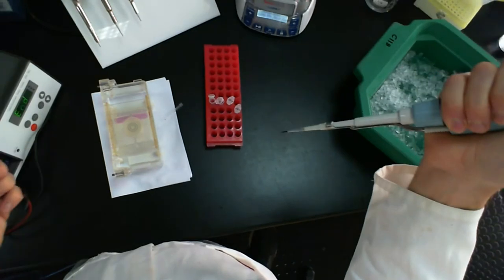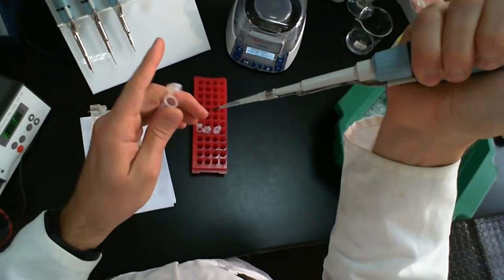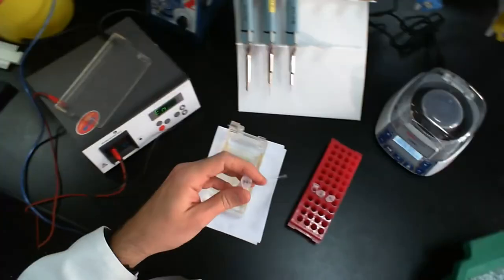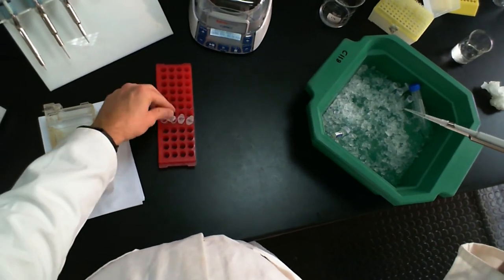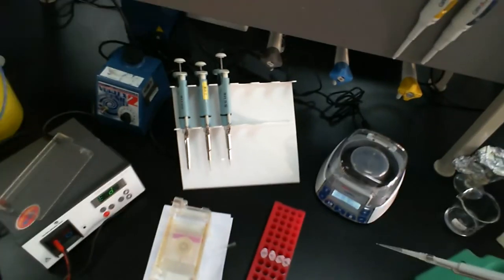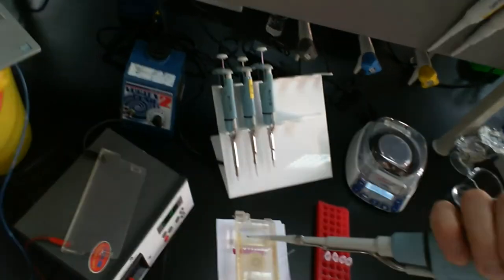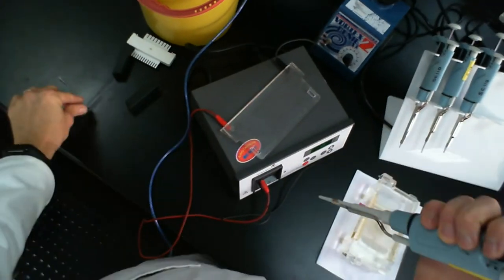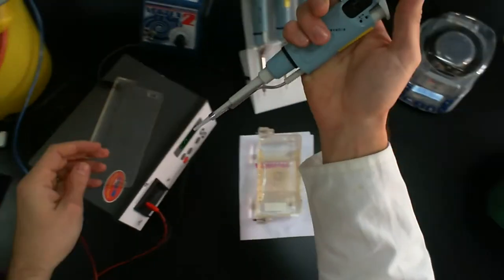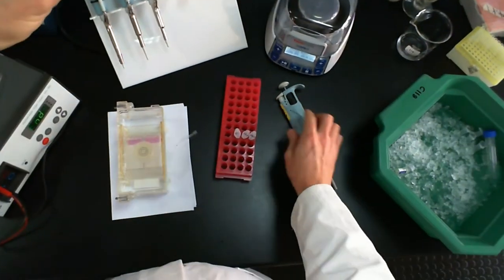Little bits. Okay, we need a new tube for you guys for tomorrow. There we go. 4. I didn't bring my waste beaker, so that's a little annoying. This cable's getting in the way too. So I'll get rid of these later. Or right now. Okay. So now I have 25 microliters in each of these tubes.